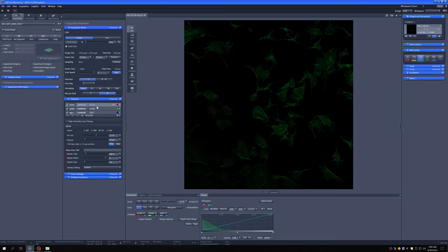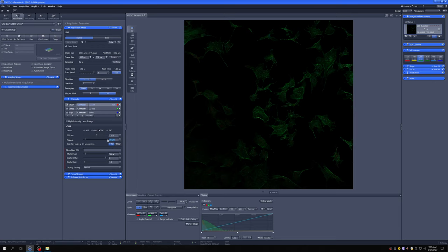By design, on any of the three channel settings, when you press one AU, all of them will have the proper value, which you'll notice, it may not be one airy unit for DAPI, but that's fine. It needs to be one airy unit for the longest wavelength dye, and then the same number here for all the rest, which it is.